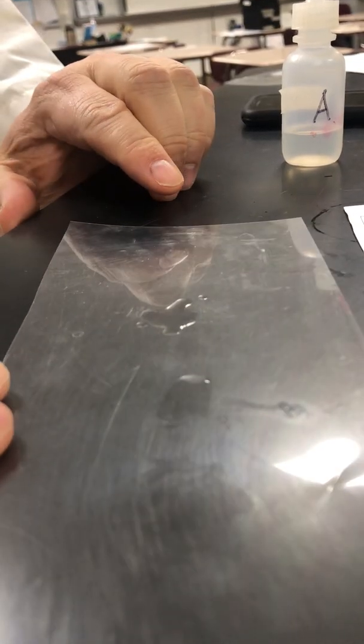And we've still got the warm ethanol up there. When I was seeing if it was there, I accidentally put a little bit more in there. So that would be an example of some experimental error introduced. So we're going to have to make a judgment when the original drop would have been completely gone. Everything is gone. If we put it back up here, you can see that there's nothing left there.